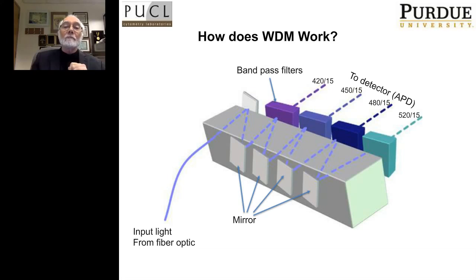So this is really a reflection. It's a mirror. It's reflecting everything. What that means is that it's rather efficient, that it's not blocking any signals. All of the light is traveling as far as it can, and the appropriate light that you want to select is going through this bandpass filter. And I'll show you in a moment how you can just drop in a different bandpass filter in there.